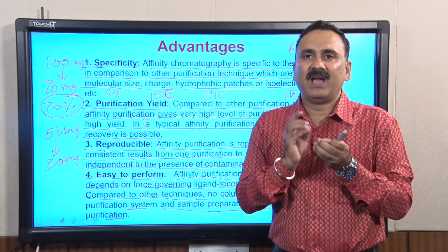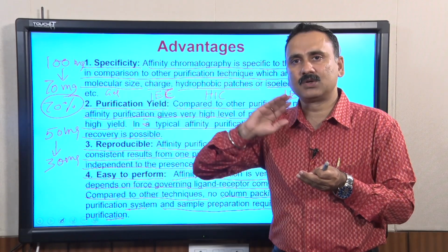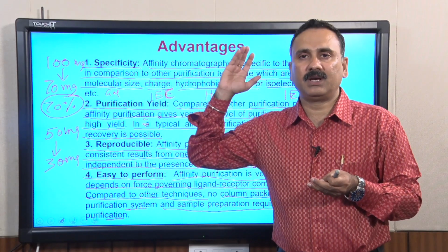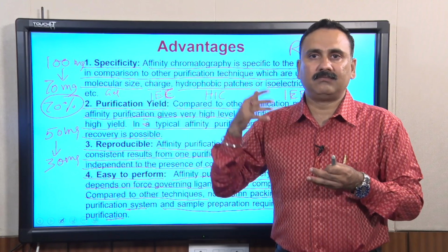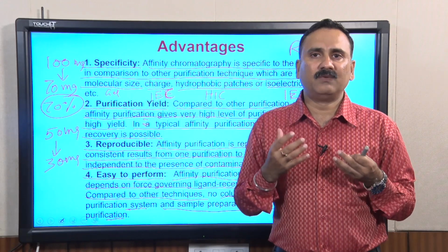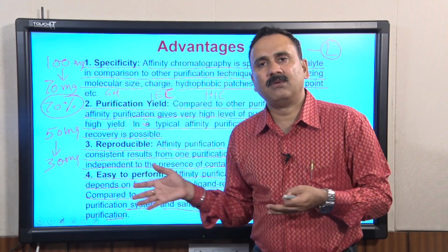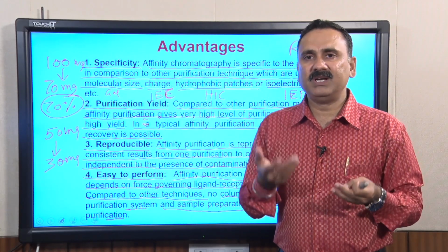These beads have the receptor or the ligand immobilized, and they have exclusive affinity for their counterparts, like the ligand or the receptor. So, in these cases you do not need a very sophisticated purification system, or you do not even need these beads to be packed.